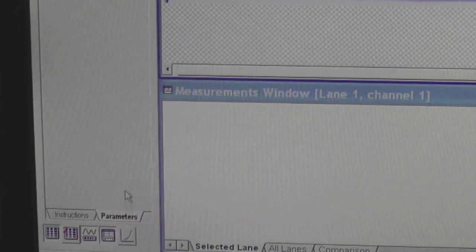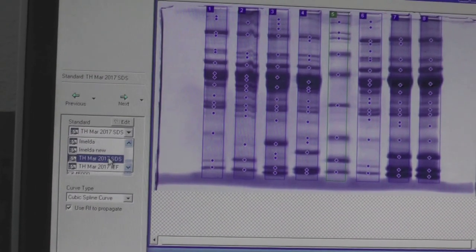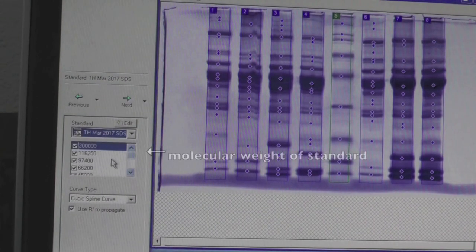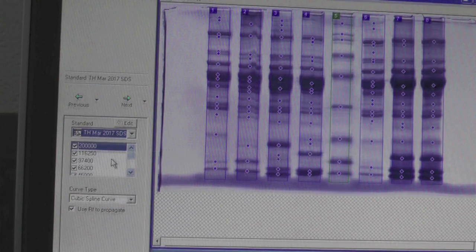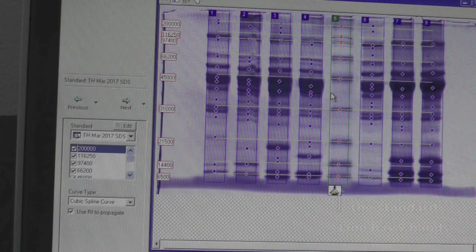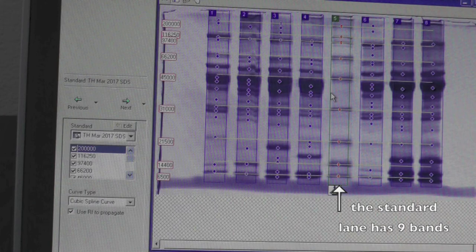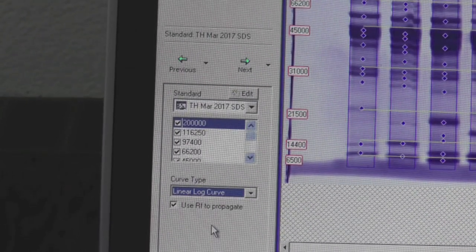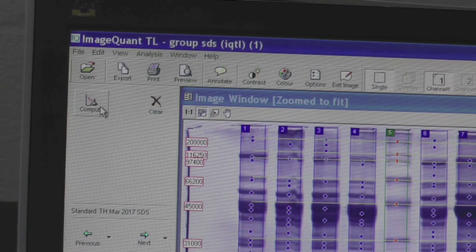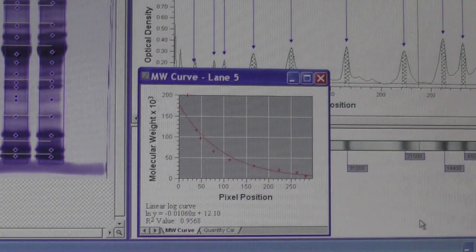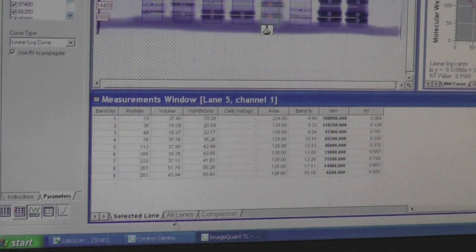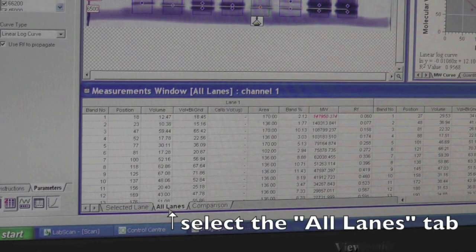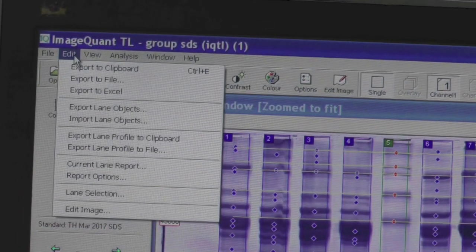Click on the Parameter tab again. Select SDS or IEF according to the type of gel you're using. The molecular weight of SDS and IEF standards should be included in those options respectively. Select the standard lane by left clicking on it. Remember, the standard lane should have 9 bands in total. Click on the Parameter tab again and from the drop-down menu, select the Linear Log Curve option. Click Compute and a graph showing the standard versus the distance traveled on the gel will appear. There should be a window on the bottom of your screen showing all data values. Make sure you click on the All Lanes tab before proceeding. Click Edit on the top of the screen and then select Export to Excel.